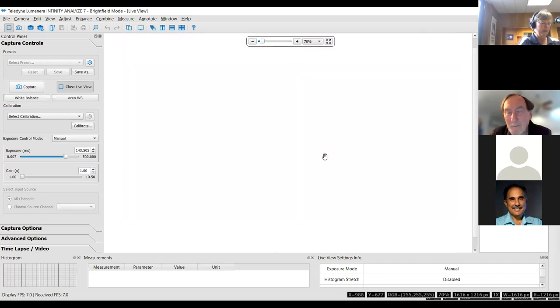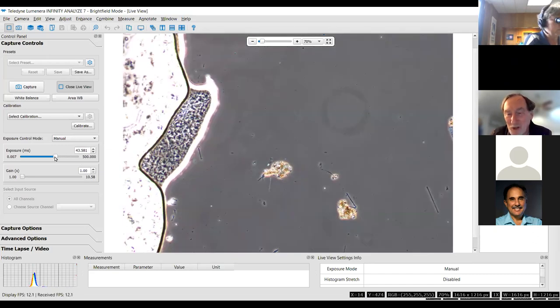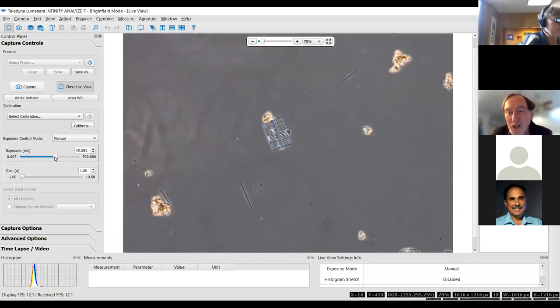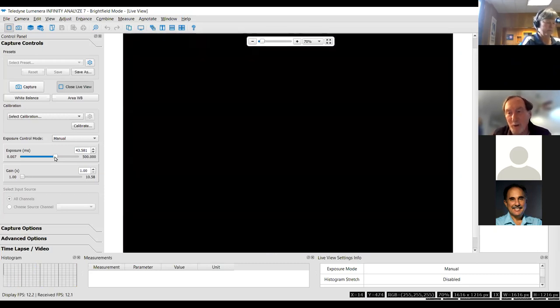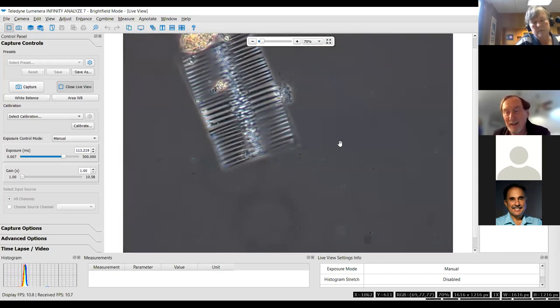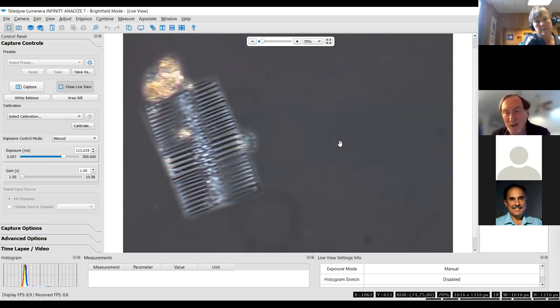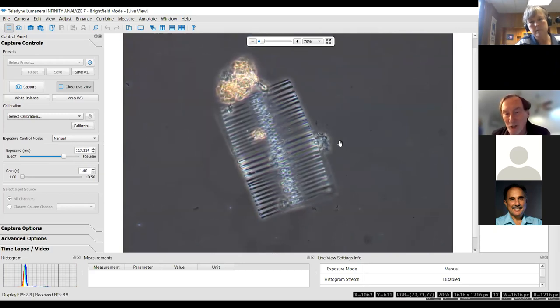While she's hunting that up, just things to keep in mind. We don't want anybody getting discouraged trying to look at this stuff, and it can be frustrating. But if you can just get in the right division to start with, and then get it into a subgroup, like motile colonial chrysophyte, that'll go a long way in terms of thinking about management and such. It may not be enough in the end, but it's a real good start.